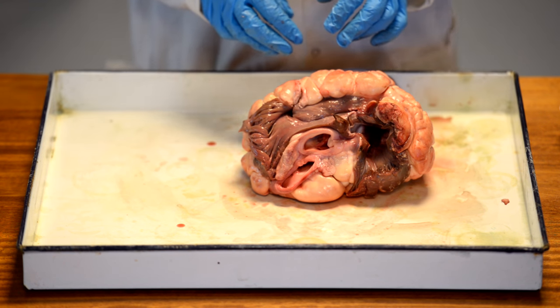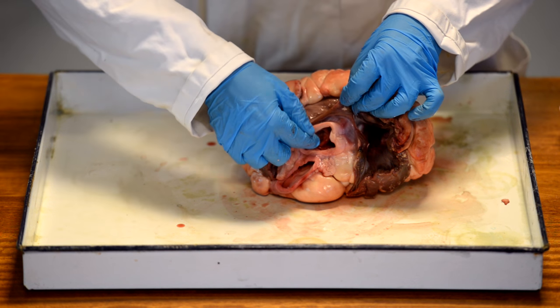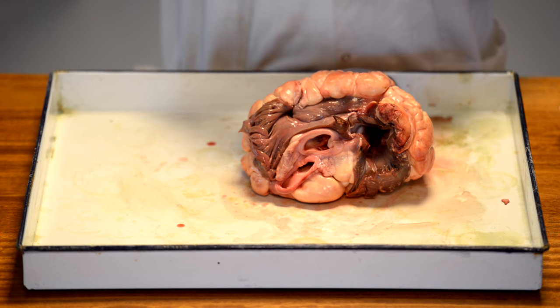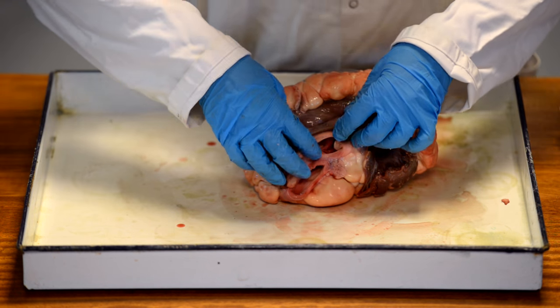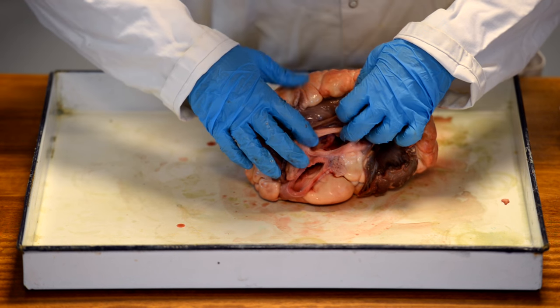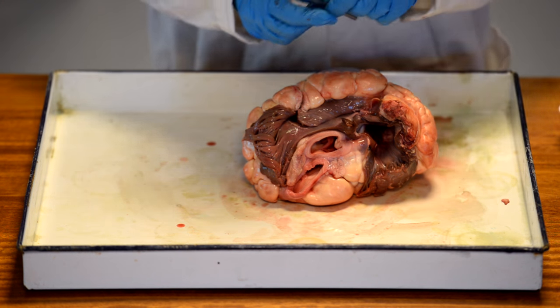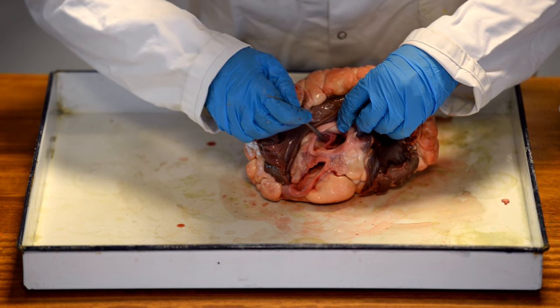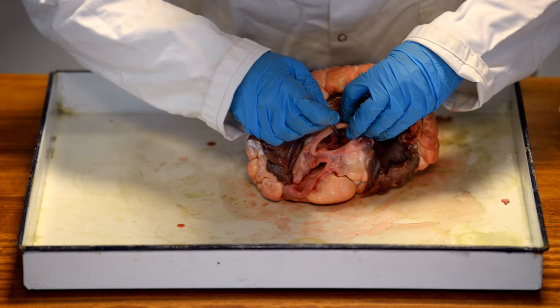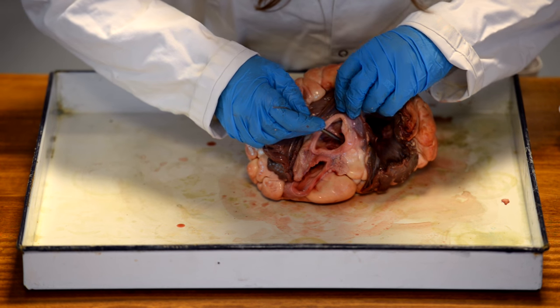Now what I want you to imagine is that when this heart is pumping, the entire blood vessel is full of blood and under high pressure. What's perhaps most interesting in the way that this has been cut, and you don't often see this on the smaller hearts, is that you can clearly see the valves which prevent the blood from flowing the wrong way in between beats. So you've got a valve here where I'm putting the mounted needle.